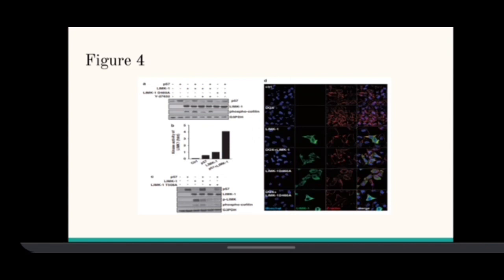Part C of the figure depicts the HeLa cells being transfected with the expression vector for 24 hours. After the 24 hours, the protein was extracted and analyzed by immunoblotting using multiple different antibodies. As a standard, G3PDH was used for equal loading of the protein.